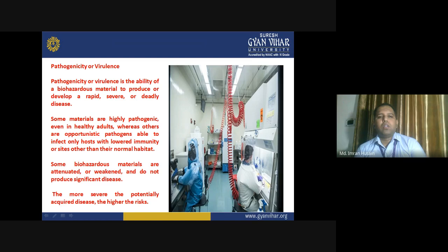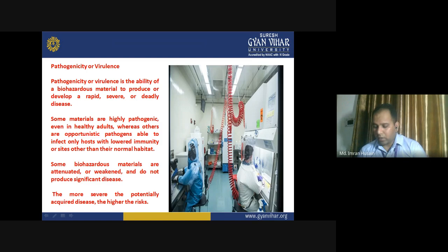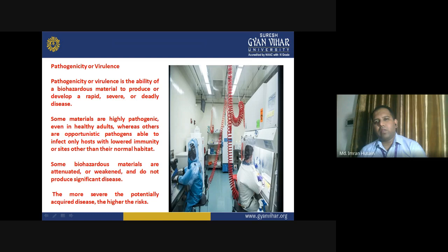Some biohazardous materials are attenuated or weakened and do not produce significant disease. Whenever scientists are developing a vaccine, they are dealing with the pathogenic material, but that particular virus has been weakened. So it does not produce a significant amount of disease, but it can readily be utilized for the process of vaccination in order to make humans safe from any further infection.